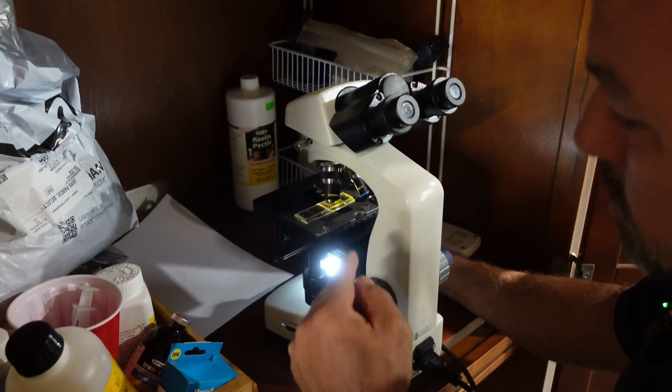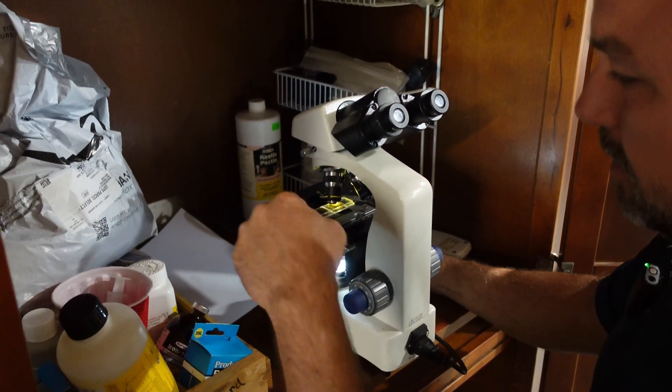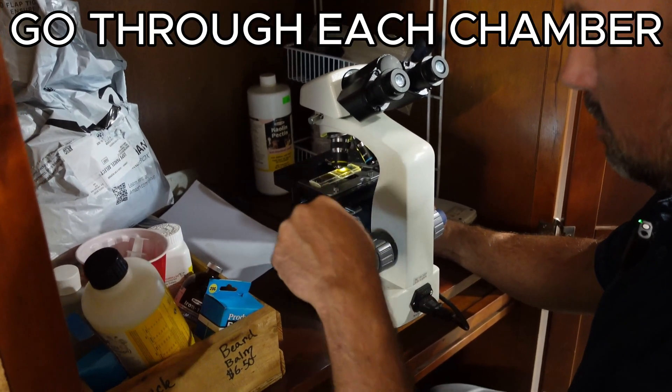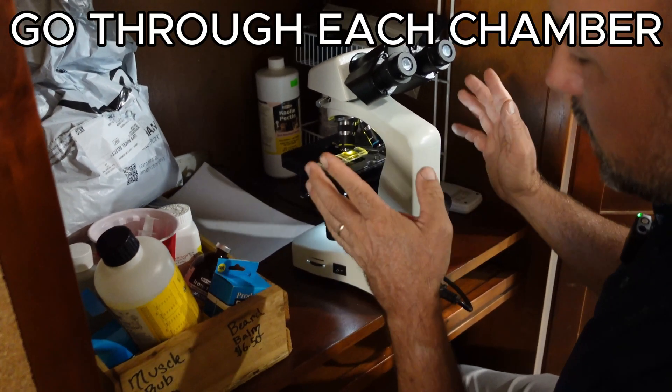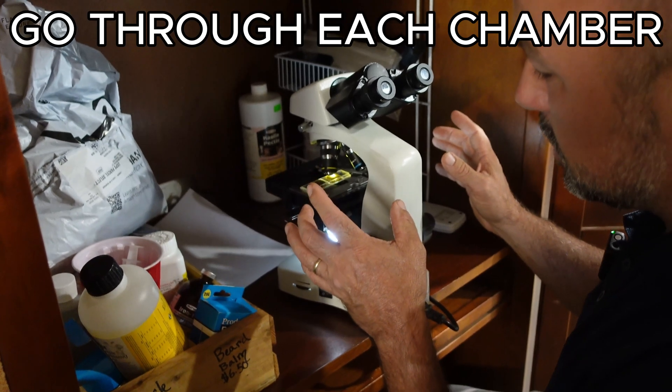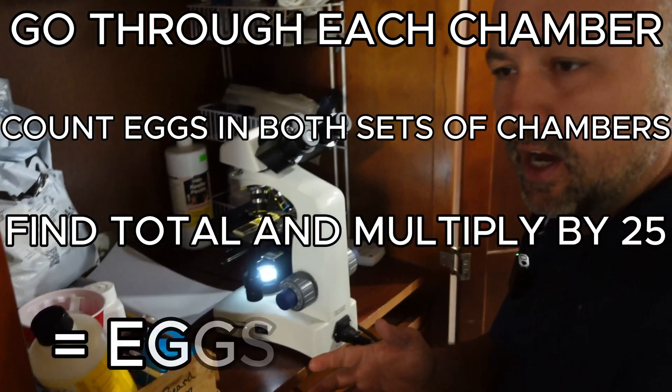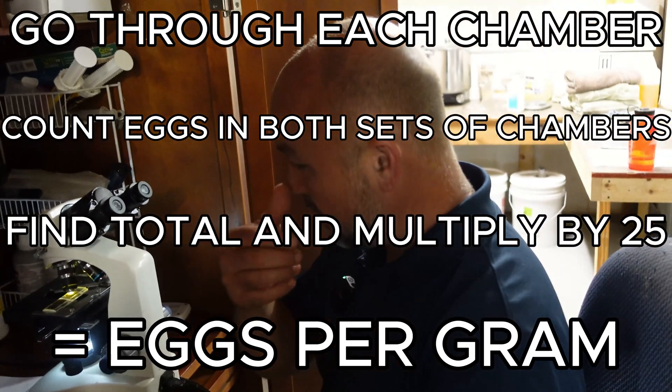What I'm going to do here is work the slide up and down and back and forth as I go through each chamber and count the eggs. Since I've got two sets of chambers, I'm going to count those, add the total together, and multiply that by 25 — that's what gives us our eggs per gram.